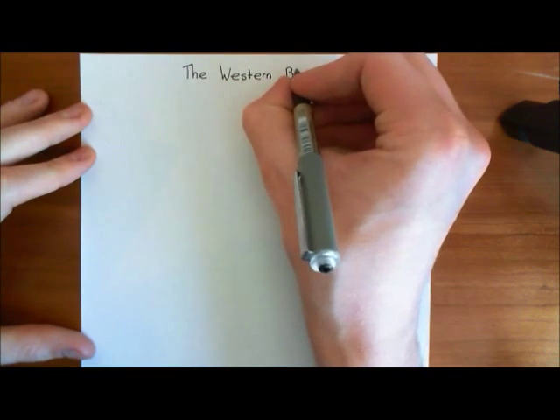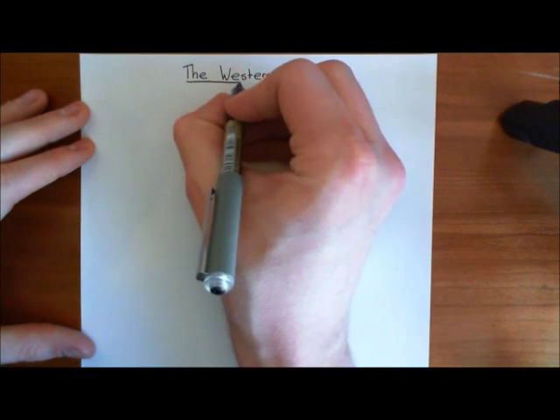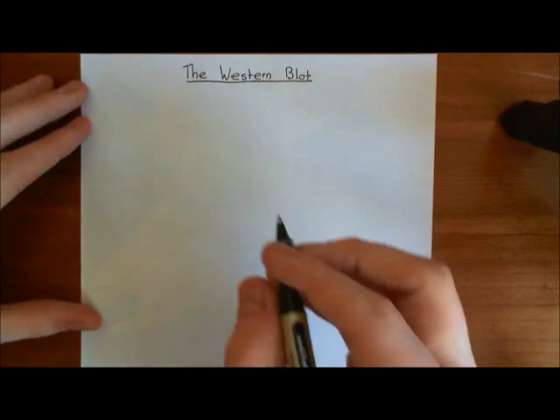So basically what we start off with is a solution that may contain a huge number of different proteins. So maybe we start off with a cell lysate. So we have taken cells, we have homogenized them, broken them up to make a lysate, and then we have spun it around and around to remove the membranes, basically the insoluble cell membranes, so that what we're left with is the stuff other than lipids, basically. So we're left with proteins, for instance, and that's what's known as a cell lysate.